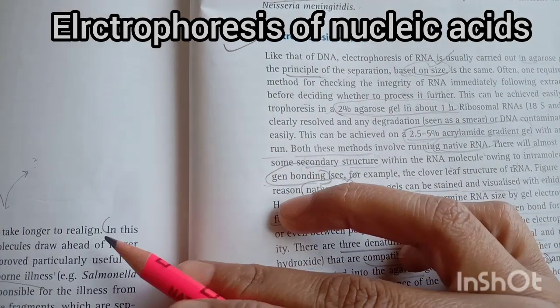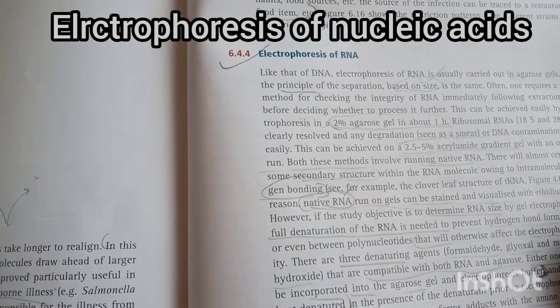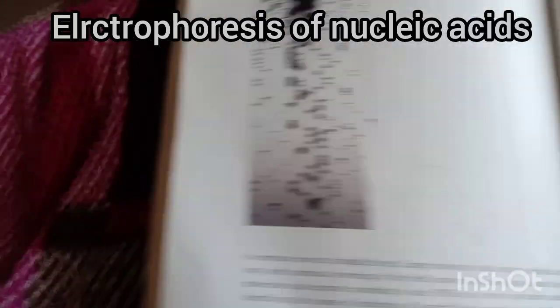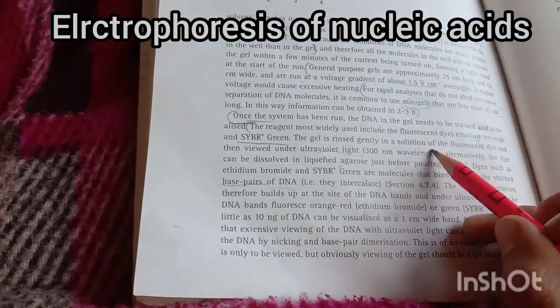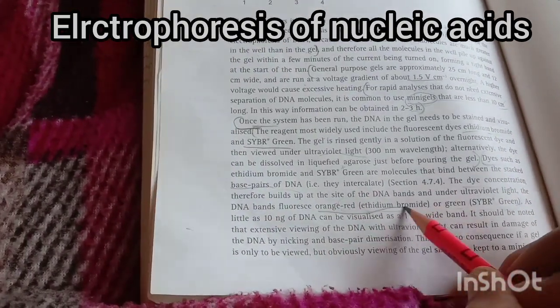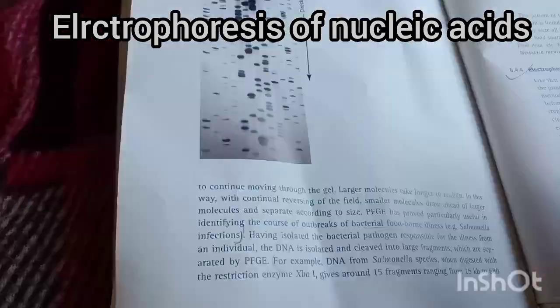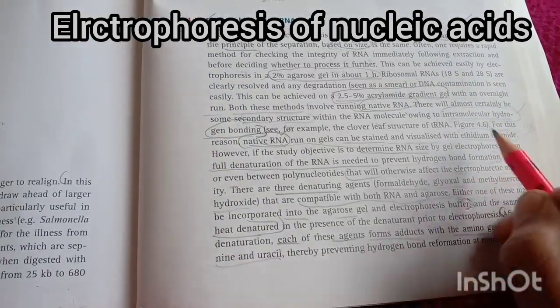Similar to DNA electrophoresis, we also use this dye. Here we use ethidium bromide, which gives the color orange red. Similarly, we use the ethidium bromide dye here.